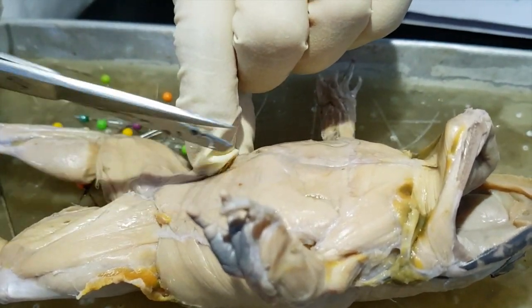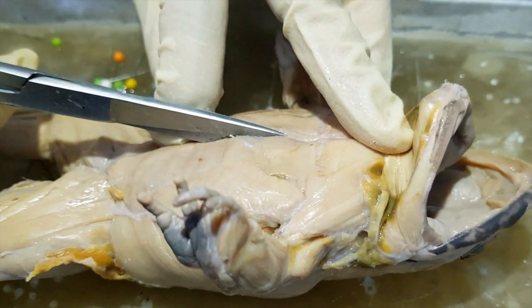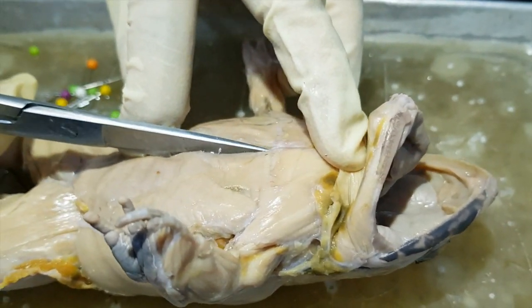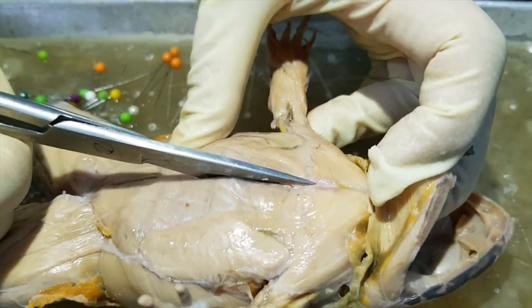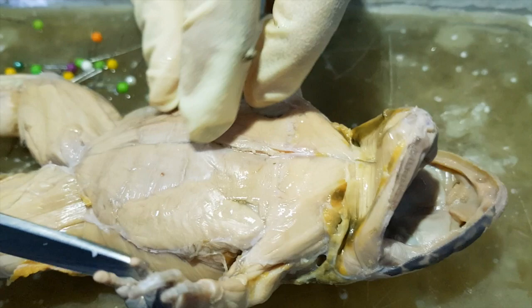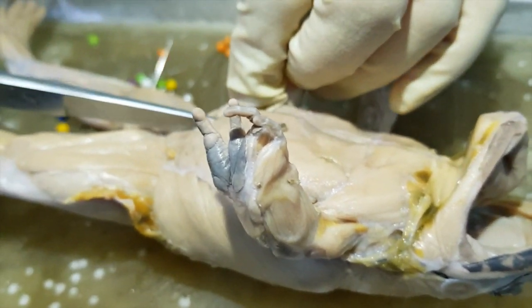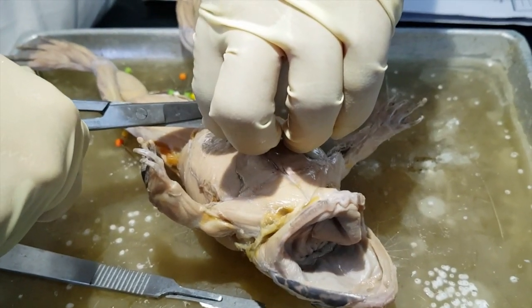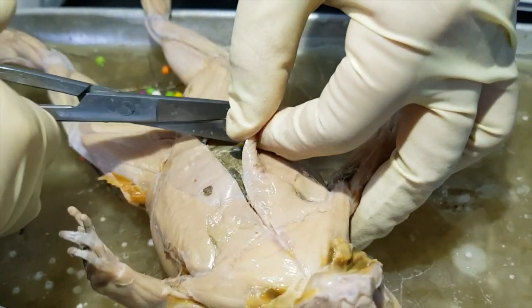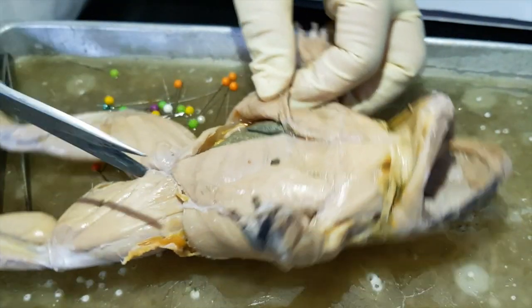Ang dami pang fluid. You can put a window by cutting on the side.